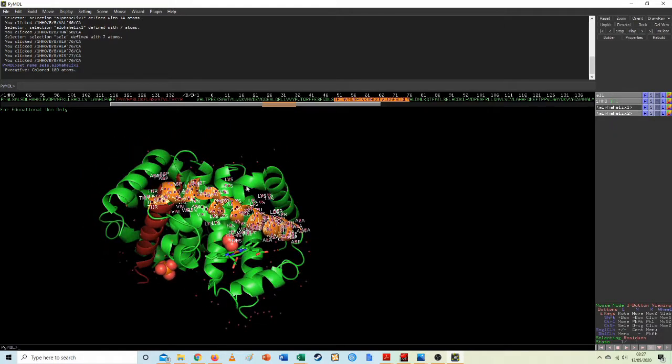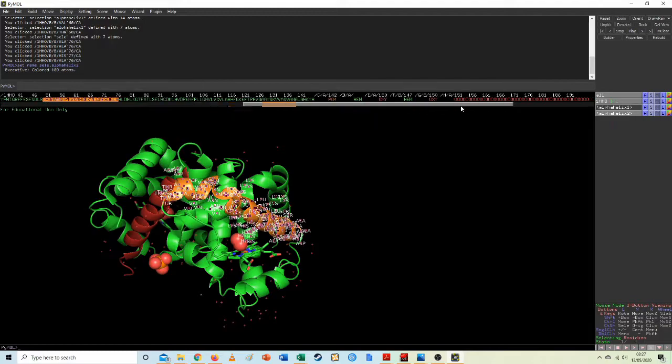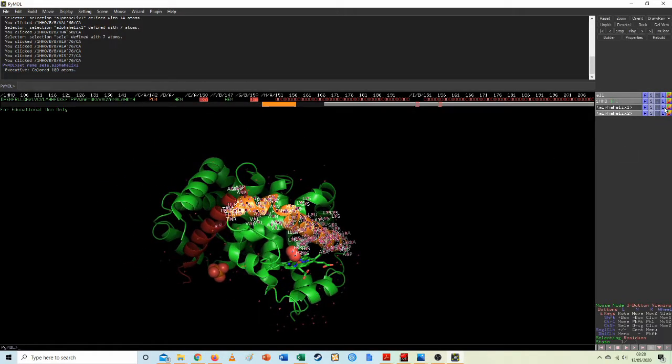So that glycine is interacting with both the other parts of this protein, and most importantly, what I'm going to show you next is the water molecules. So this is our oxygen. Now I'll change that oxygen and that oxygen, and I'm going to make them a nice marine blue.